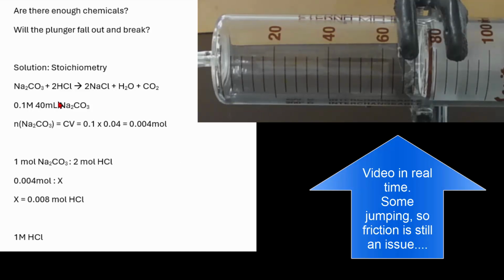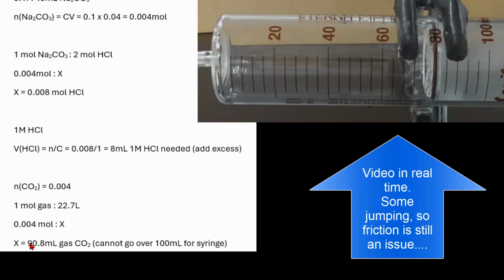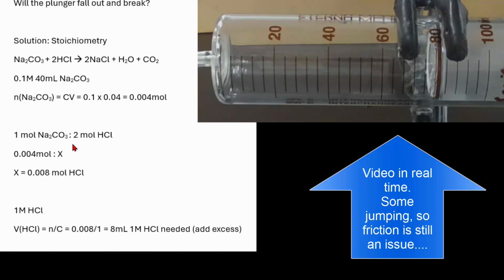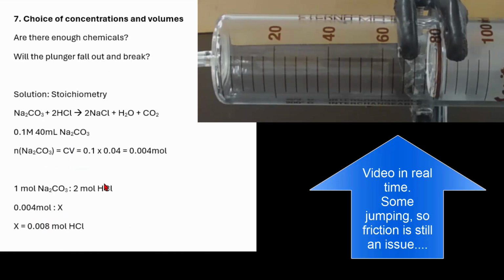And so this is probably for senior chemistry students to be able to do the numbers, or your teacher will have to do it for you. So I've just reverse engineered that. I went to ChatGPT to get a rough number, and then turned it into a nice neat number. And then looked at the shelf to see what I did have, and I did have 0.1 molar, and there's a whole heap of HCl concentrations we have, but we don't have many of these things. And so they're the numbers I used.